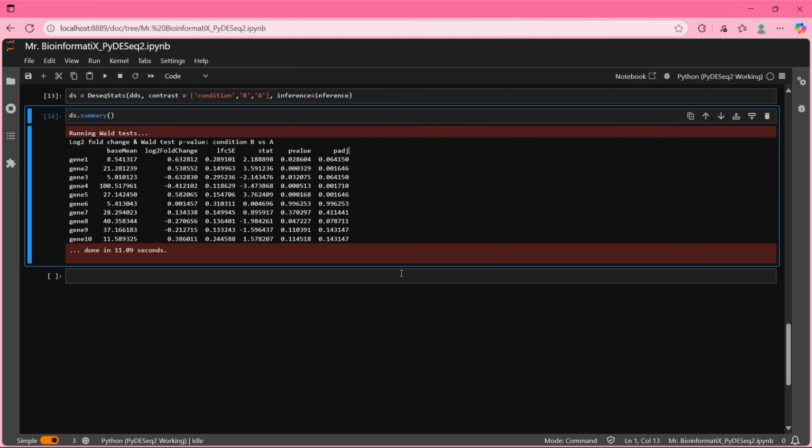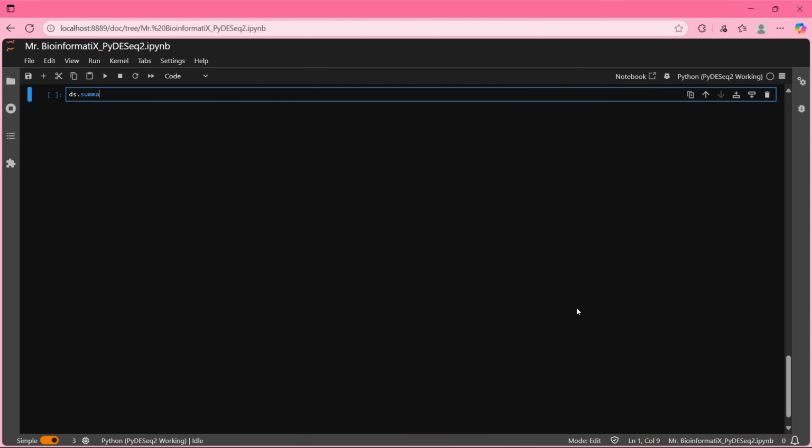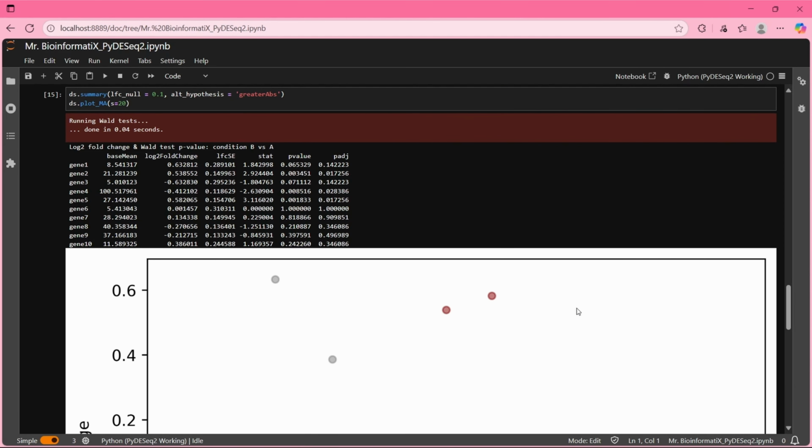The alternative hypothesis corresponds to what we want to find rather than the null hypothesis. So, and here we have it.